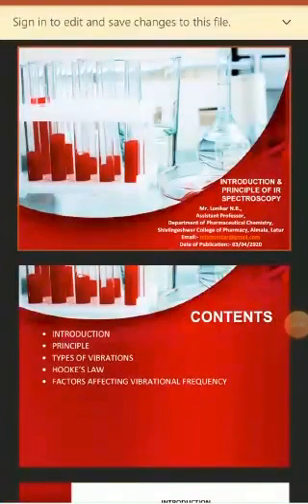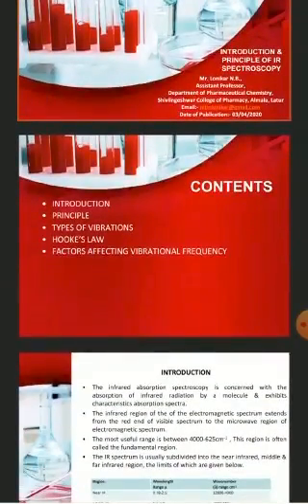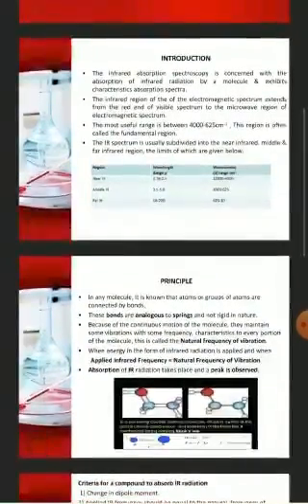Students, today we have learned Introduction and Principle of IR Spectroscopy. It contains Introduction, Principle, Types of Vibrations, Hooke's Law, and Factors affecting Vibrational Frequency. So firstly, we have seen the Introduction of IR Spectroscopy.